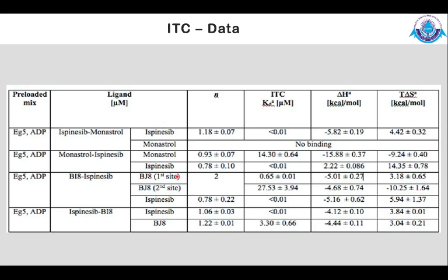That means we have identified a new binding site, and this observation is further confirmed by structural studies. In the absence of structure, this experiment alone could tell us that one binding site is the existing site and the second is a new site, which would have been conclusive proof for that hypothesis.